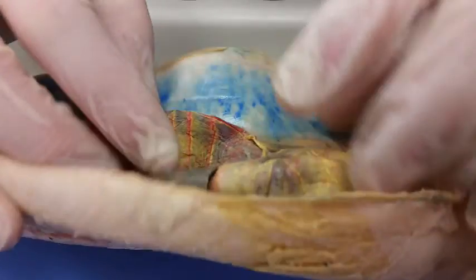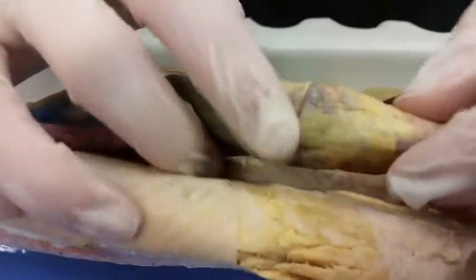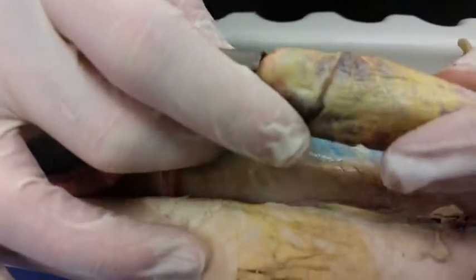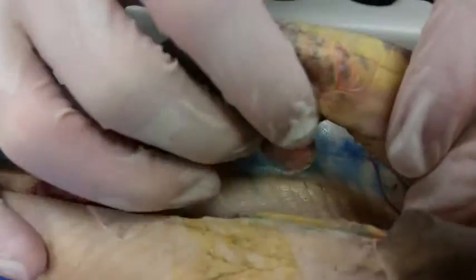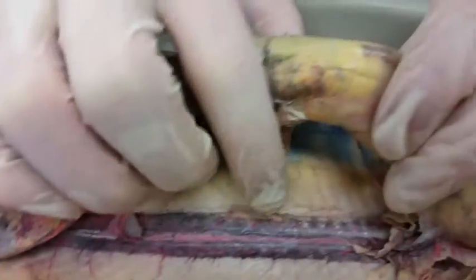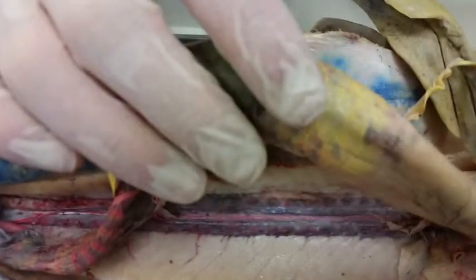There is one thing that we cut out for the most part to be able to access all of the organs, so we can't see it, but there should be a very thin ligament connecting all of this to the area near the dorsal aorta, which is called the greater omentum. So there should be a ligament here called the greater omentum. We cut ours out.